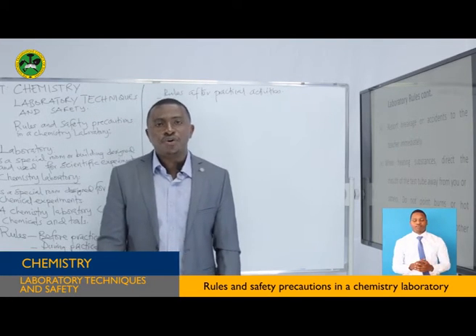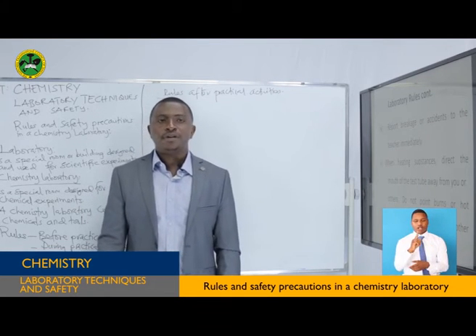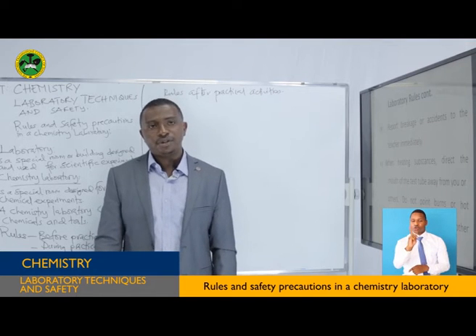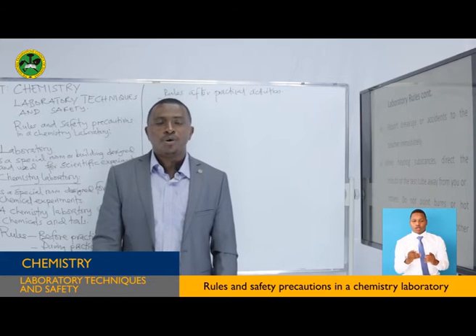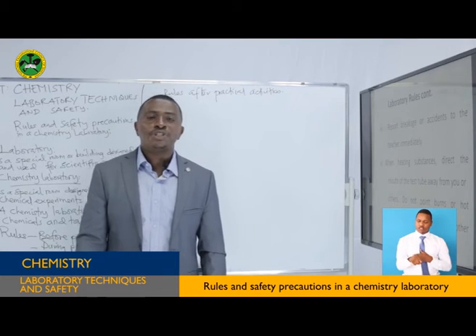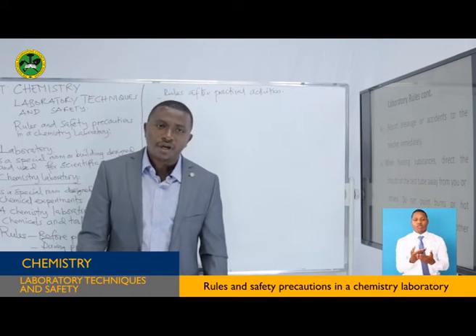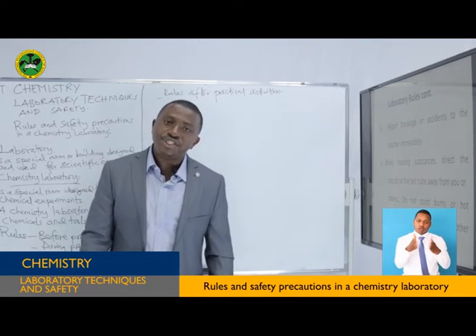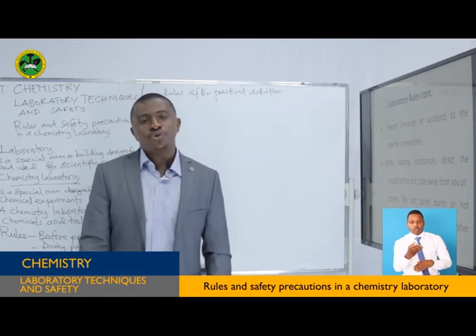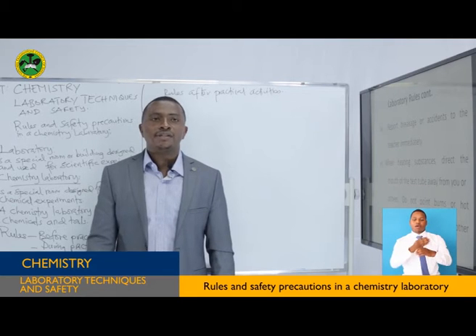Do not ignore it, thinking this is a minor cut, I won't inform the teacher. There is no minor cut in the laboratory. You should inform your teacher, you should inform your laboratory assistant what kind of accident that was. What type of burn? Is it due to chemicals? Is it due to hot liquids? Or is it due to open flames? Or is it due to touching hot objects? So you better inform your laboratory assistant for assistance.